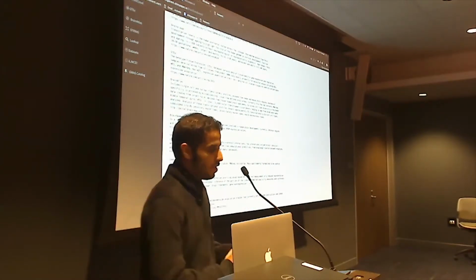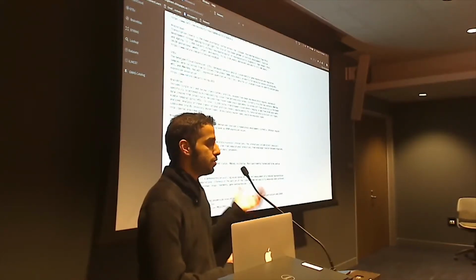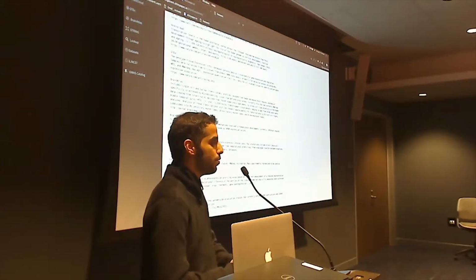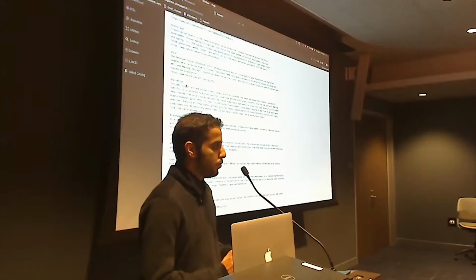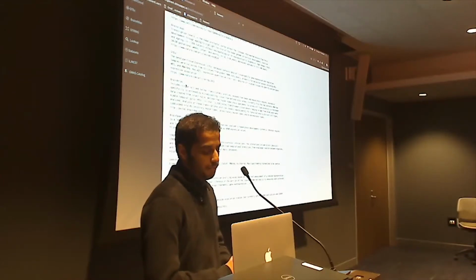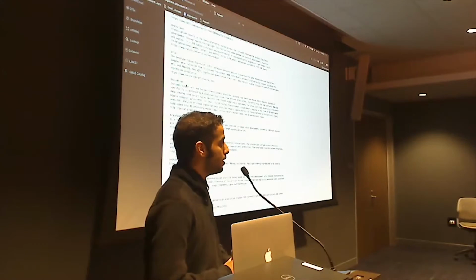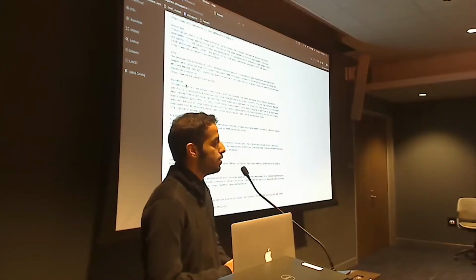Also, we have the GTEx, genotype tissue expression, where you can see the expression levels in different tissues in the body. We have the brain atlas. It's a huge database for the brain. It gives you also single-cell RNA-seq data, but it's more involved, in that we have more clusters of cells. We have the inhibitory neurons and excitatory neurons as well.